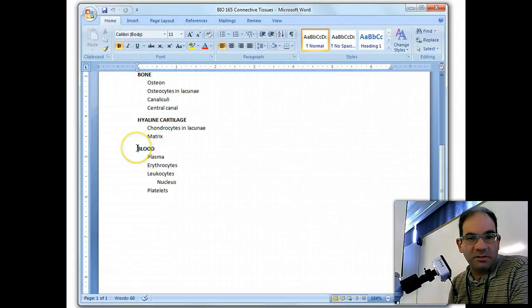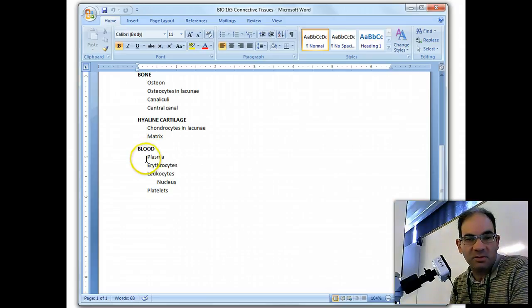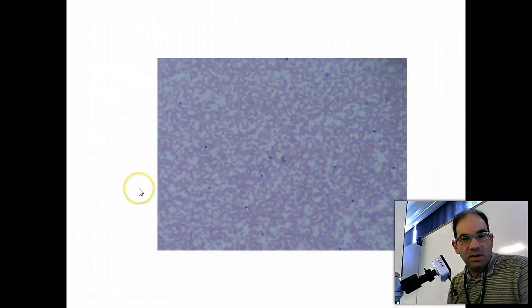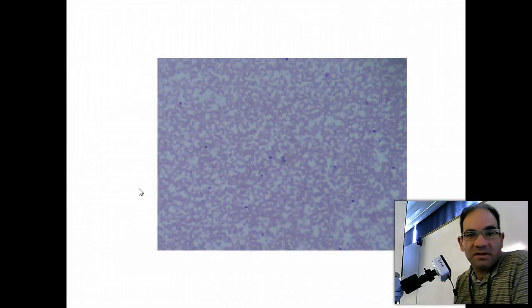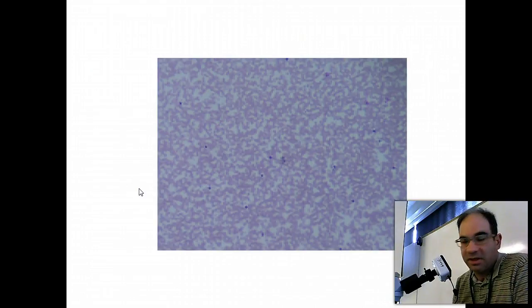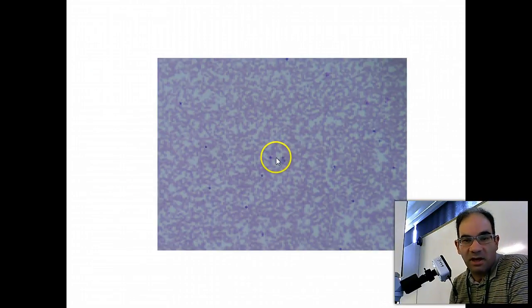Our next tissue type is blood, and this is our fluid connective tissue, and we're responsible for plasma, erythrocytes, leukocytes, nucleus of leukocytes, and platelets. So here we are at 100x, and you can see pretty much just a sea of pink with some darker dots in here. So if I now move up to 400x, we can see a little bit more detail.